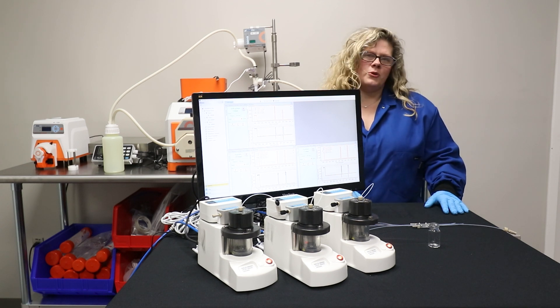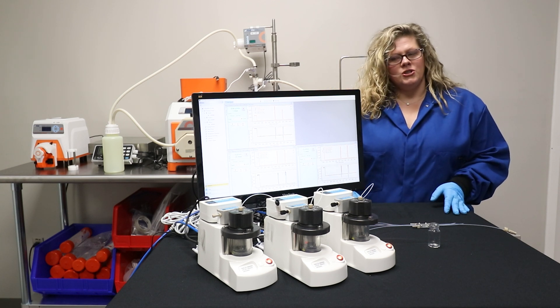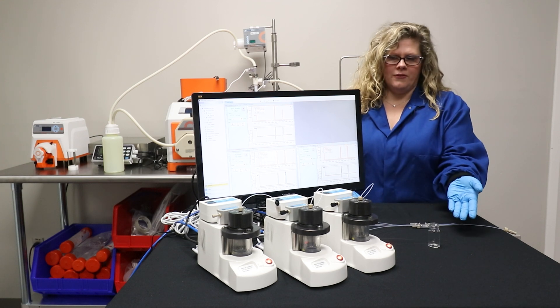There are many different vendors for microfluidics devices. Ours uses compressed air to pneumatically control flow through the product chambers, through the chips, and into the vial.